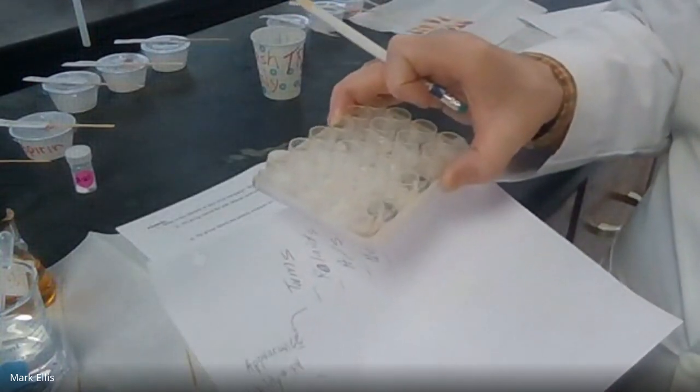It's the same procedure, but I've already got this made out for once I clean out my well plate really well. Clean it out. It doesn't have to be super duper dry, but clean it out, definitely. And I had this made out ahead of time. It's just like the one for the pain relievers, but one of your lab partners could fill this out ahead of time so you're ready to go.